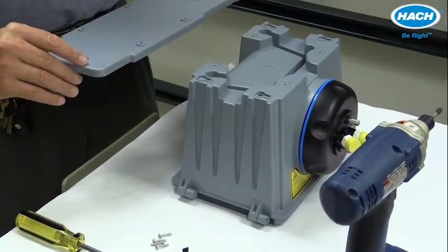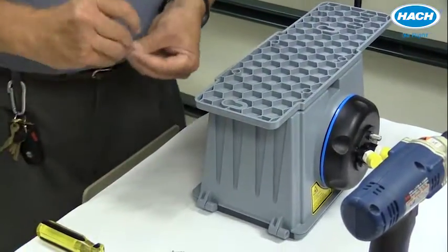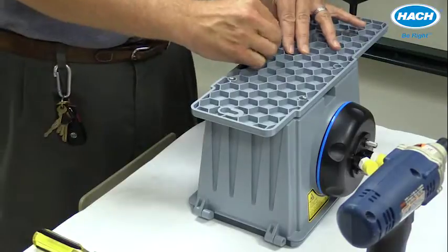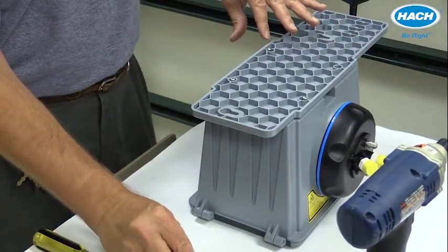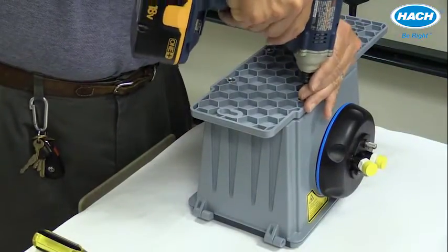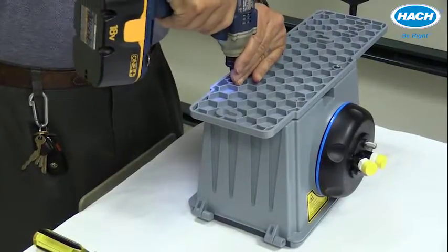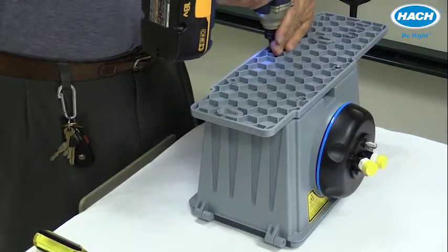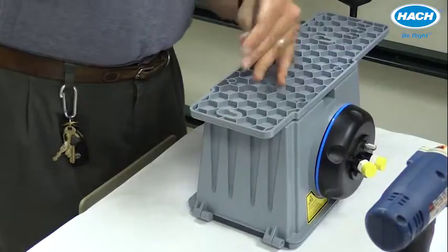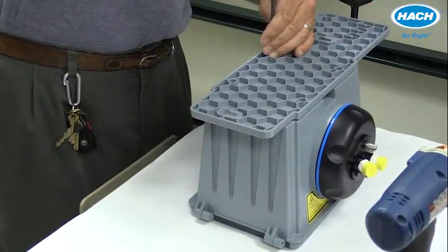Mount the bracket to the back of the TU5300 or 5400 using the screws included with the bracket. Tighten them down manually with just a Phillips screwdriver. It's just that easy.